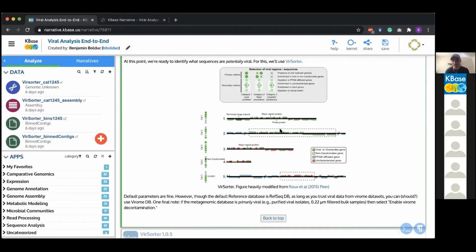You still have a lot of viral-like genes, and maybe a few uncharacterized genes. You still have that minimal strand switching going on. And interestingly, a characteristic of viruses, I should say, is that they don't have a lot of hits to databases like PFAM. And I know people might be grumbling about uncharacterized or hypothetical proteins.